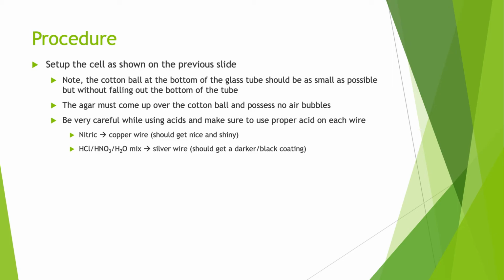The other thing I will note here procedurally, when you go to get your wires, you are going to want to clean them. And we do clean them with acid, so you do want to make sure you're taking caution. We are going to be using concentrated nitric acid. It's probably the most dangerous chemical you'll really use all semester long, so do be careful with it. If you get it on yourself, it will burn. It'll probably turn your skin yellow if it happens.